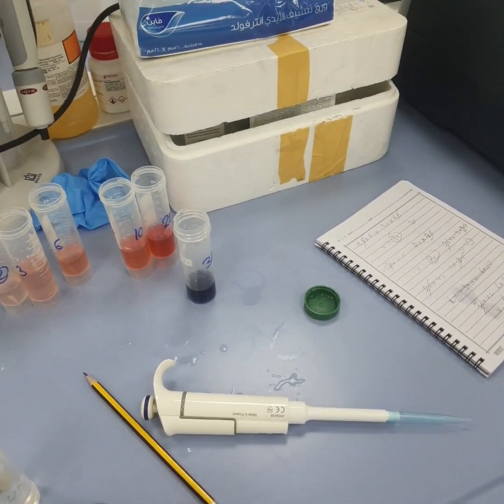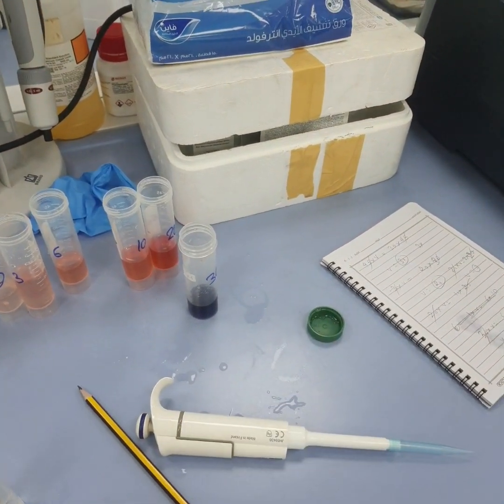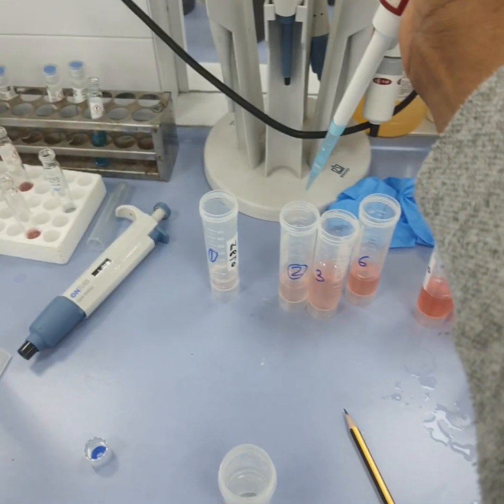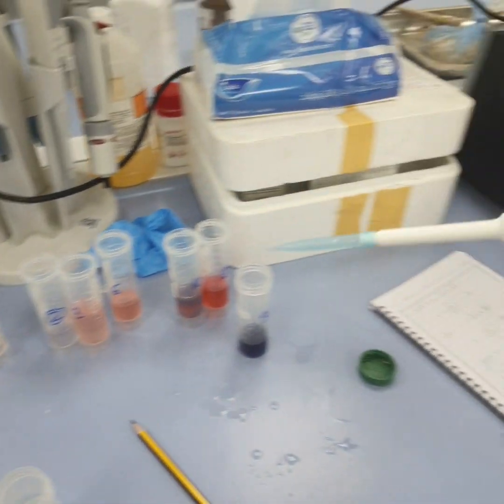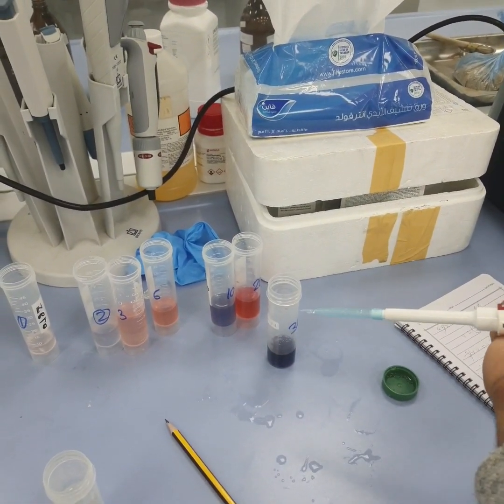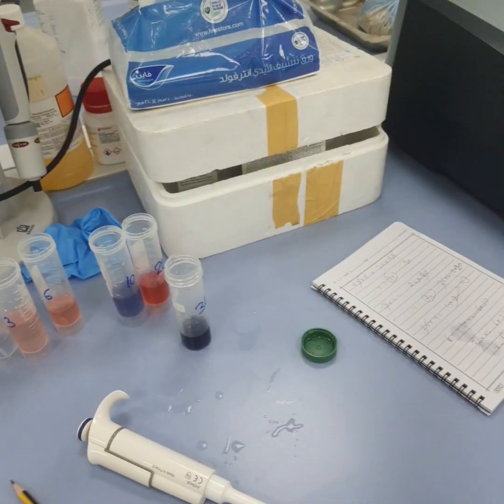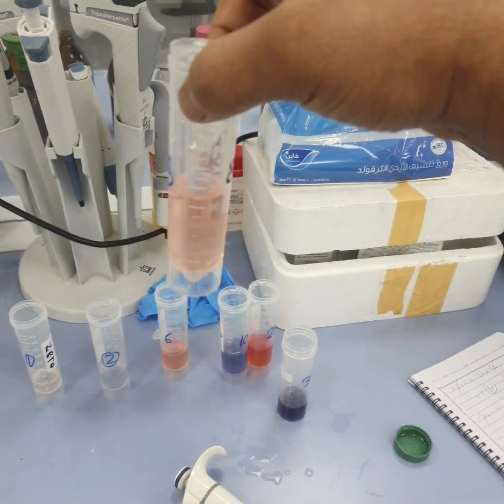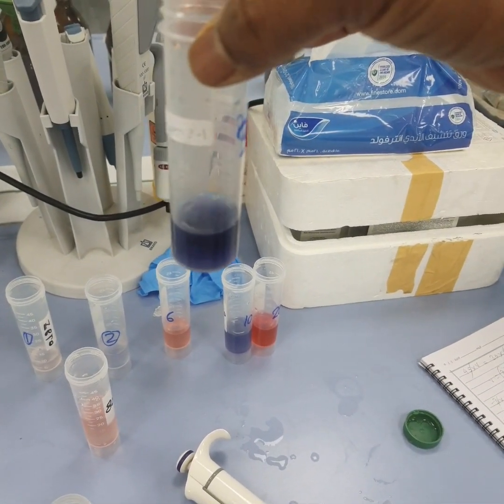So you should work with this dye from pH beyond 5. Usually I prefer to work from 5 to 10, not in the highly acidic range, not in the highly basic range. You see now, all change. Right now the pH will be around 5 to 6. If you are going below 5, it will not identify this. The color was red, red orange, and it became totally blue after adding acid, right? Okay.